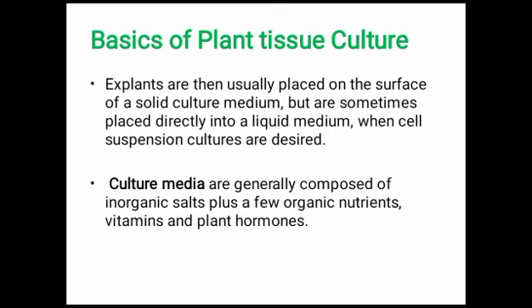Explants are first transferred onto the solid culture medium, but sometimes they are transferred directly into the suspension culture method, when desired. Culture media are generally composed of inorganic salts plus a few organic nutrients, vitamins and plant hormones. When we transfer any explant, cells or organ of the specific plant into the artificial medium, it provides all types of nutrients essential for the growth and development of that plant part.